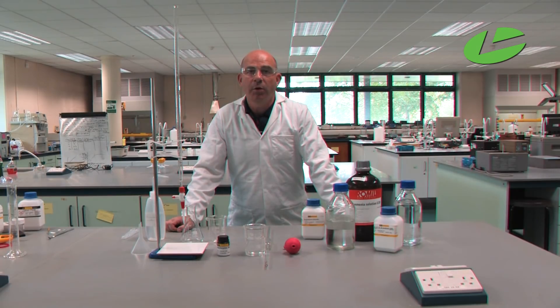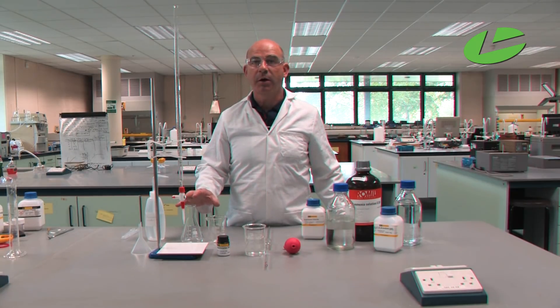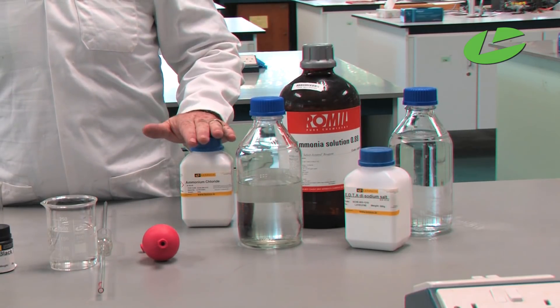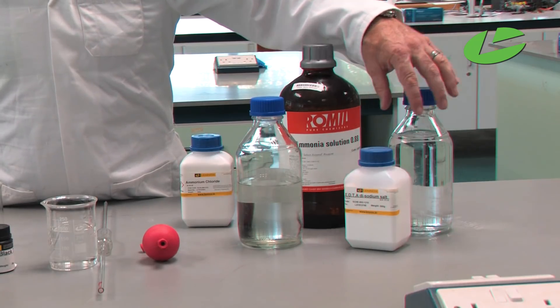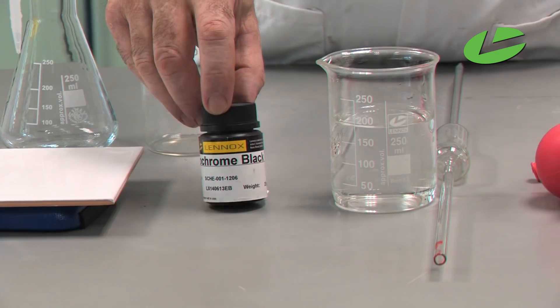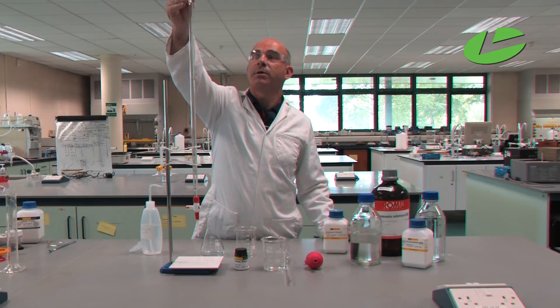In this practical I'm going to be doing a titration in order to determine the amount of calcium in a water sample. I'm using standard titration equipment: a burette, pipette, beakers, conicals, and a funnel. I need a pH 10 buffer solution made using ammonia and ammonium chloride, a 0.01 molar EDTA solution, and the indicator eriochrome black T.